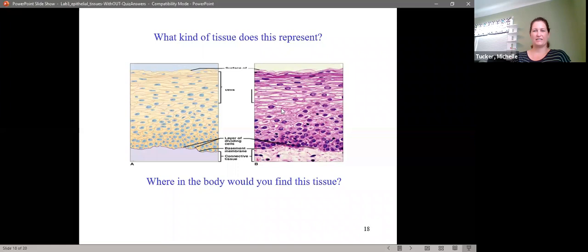And then they get squishier as they go from younger to older. So it is a stratified squamous epithelium. So stratified squamous, they'll start with these little circular nuclei, and both the cells and the nuclei are going to flatten out as they progress towards this apical or an older surface.